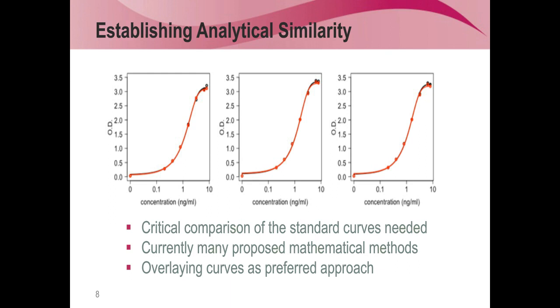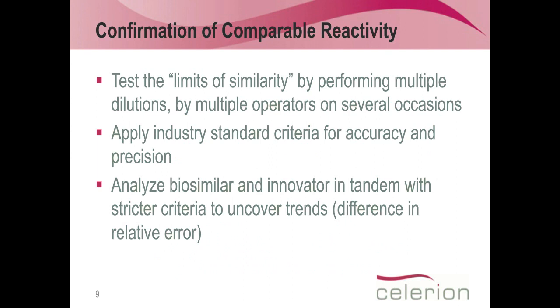So in the second step, we essentially move away from the non-GLP development phase of the project and move to the GLP lab validation. And we want to basically stress the assay now as much as possible in the validation lab. Usually most people will not tell you that.